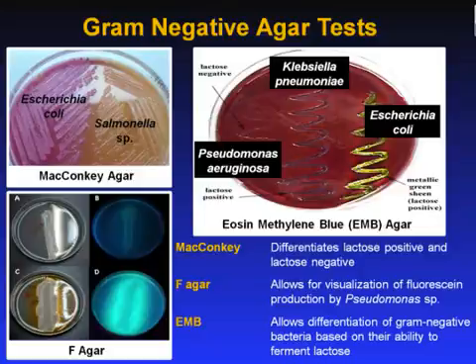Non-lactose fermenting bacteria such as Salmonella, Proteus species, and Shigella cannot utilize lactose and will use peptone instead. This forms ammonia, which raises the pH of the agar and leads to the formation of white or colorless colonies, or appear the same color as the medium. Some organisms ferment lactose slowly or weakly and are sometimes put in their own category. These include Serratia and Citrobacter.